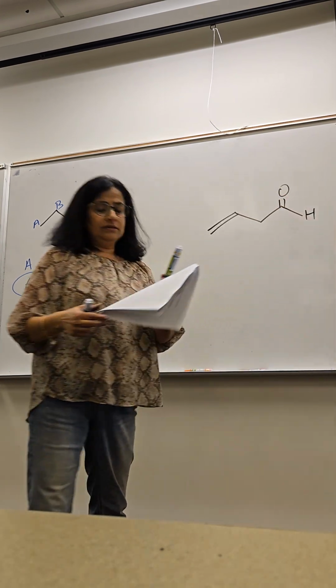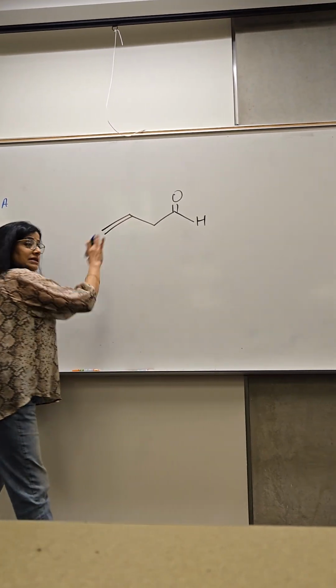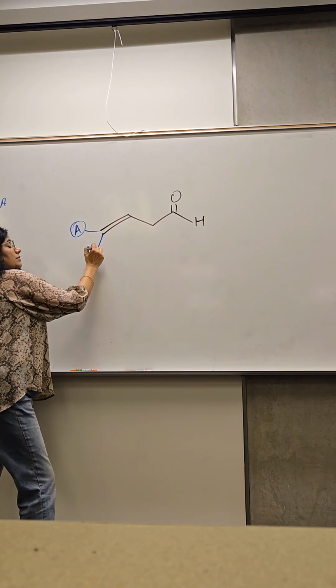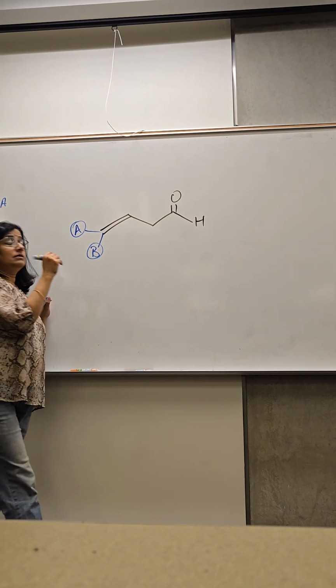How many signals did this one have? 5? Do you all agree? It's on the page. Remember, these were different, they're diastereotopic, right? Yes.